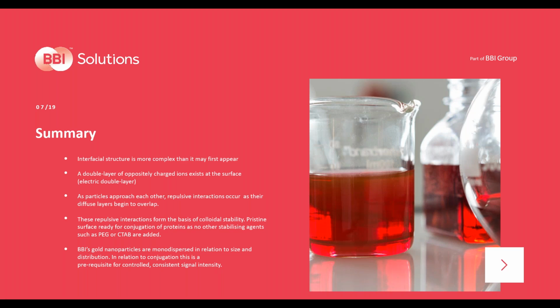monodispersity regarding particle size, BBI has a specification it applies to the particle size, known as the coefficient of variation or the percentage CV. For the particles to meet this specification, they must consist of a monomodal, monodisperse population of particles with regards to particle size.